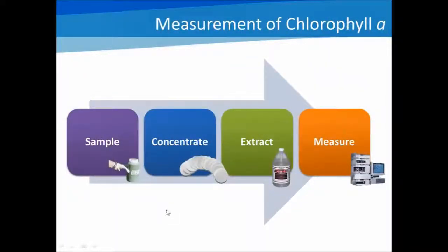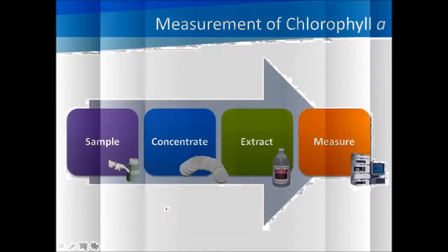So before we start talking about field measurement, I want to walk through the process for lab sampling chlorophyll A through extractive pigment analysis. There is a lot of confusion around users around differences between in situ chlorophyll fluorescence with the field sensor and the process I'm going to review here, which is the lab extraction of chlorophyll A from a field sample. And by the end of this presentation, we'll make that abundantly clear.